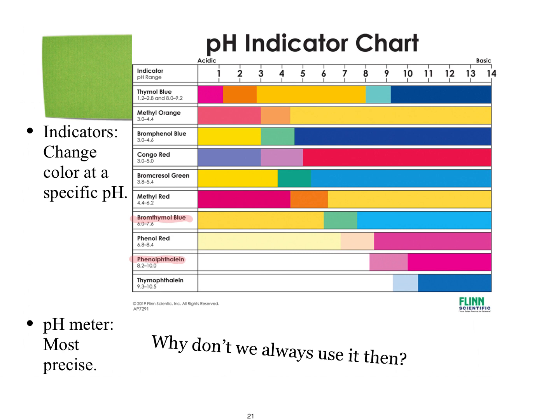Also, they're least precise around a pH of 7, because the way they work is they're measuring how many ions are in solution by running a little bit of electricity through the solution. When the solution is neutral at a pH of 7, that is when there is the least amount of ions in solution, so it's the least precise. They're best with extremely low pHs or extremely high pHs, but not all that sensitive around 6, 7, and 8 pH. So that is one limitation to the pH meter.